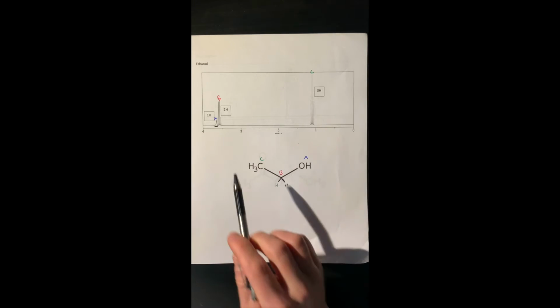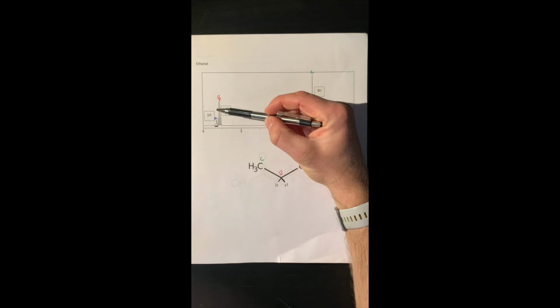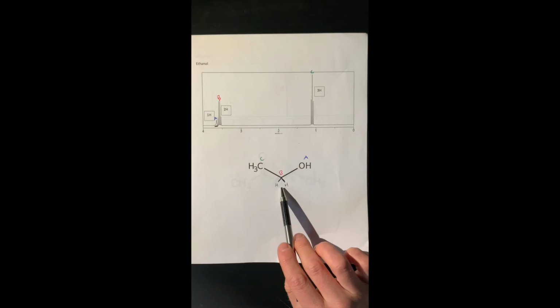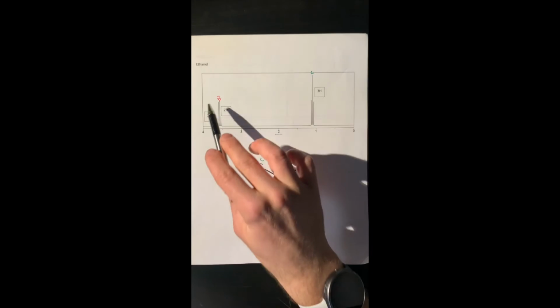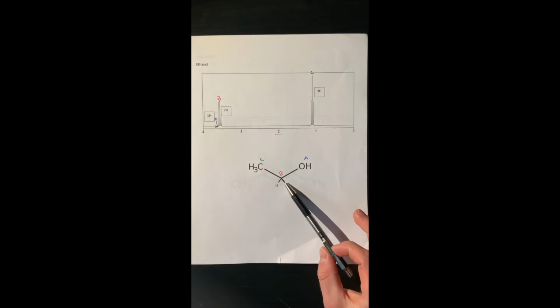The next peak you can see is right here, about 3.5, 3.6 ppm. This is a quartet, so you can see the 2 tall middle peaks and then 2 shorter peaks on the outside of it. This quartet represents these 2 hydrogens, labeled B. And it's significantly downfield compared to these hydrogens, because it's attached directly to a very electronegative element, which pulls signals downfield.